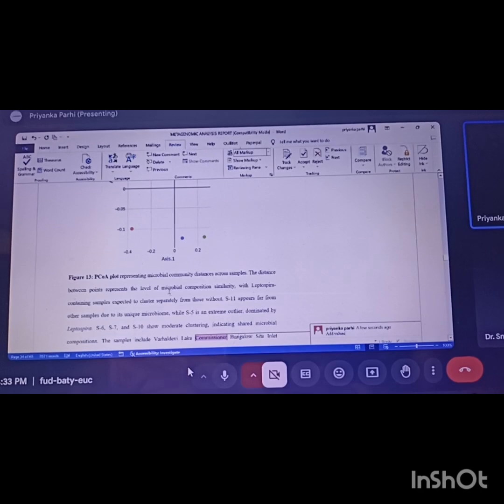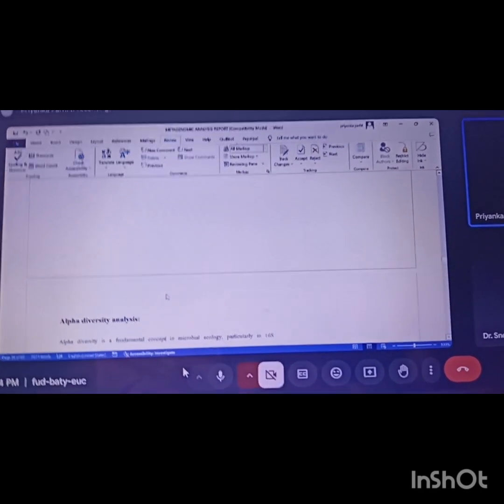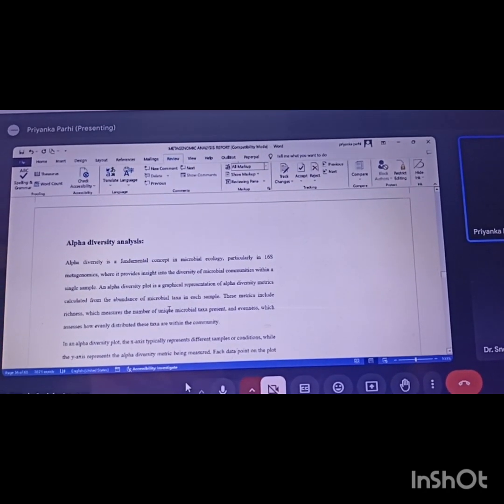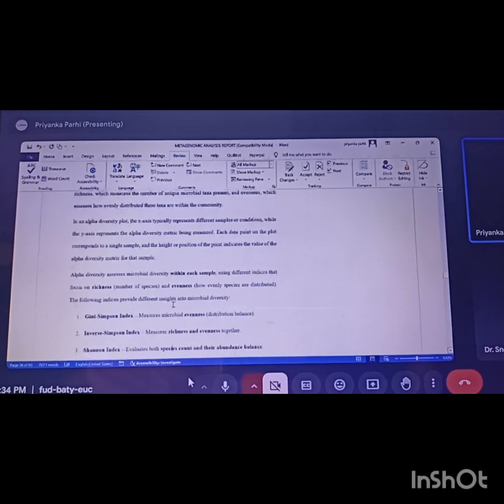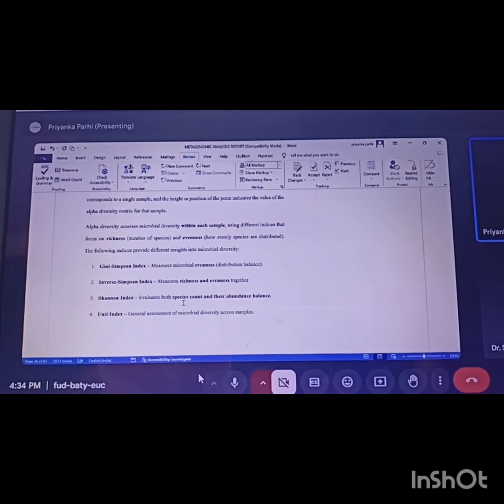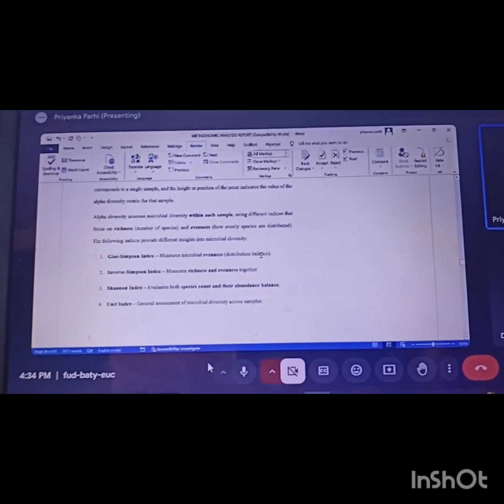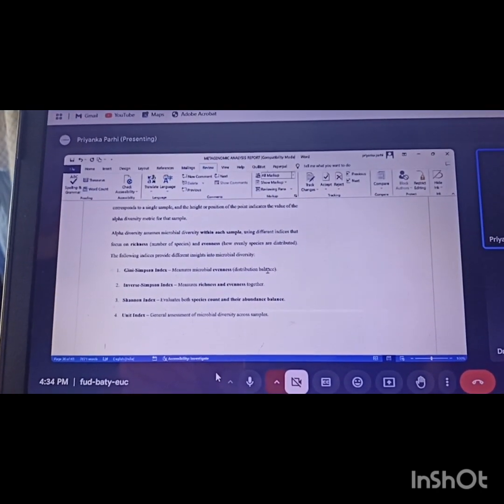Okay, I got it. I think I'm getting what kind of data you require. Alpha diversity should be in this; also we have plotted all these indexes. These are different analyses we do to see the microbial distribution. So how many microbes, how evenly? How to explain this?